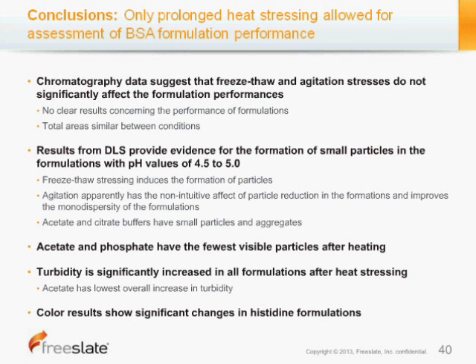Although there was a small correlation between acetate and citrate buffers having real particles and aggregates. And then as far as visible particles, those could actually be pretty significant, and it was the acetate and the phosphate formulations that appeared to have the fewest visible particles after the heating process.